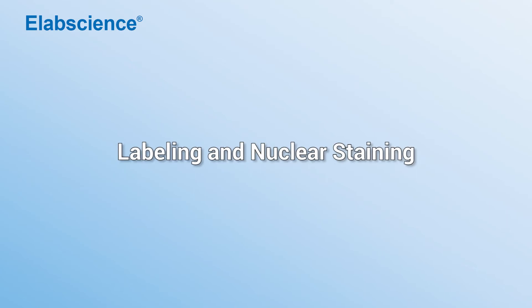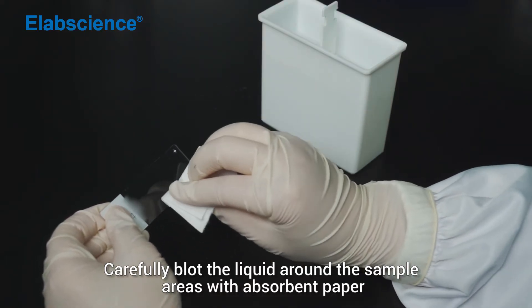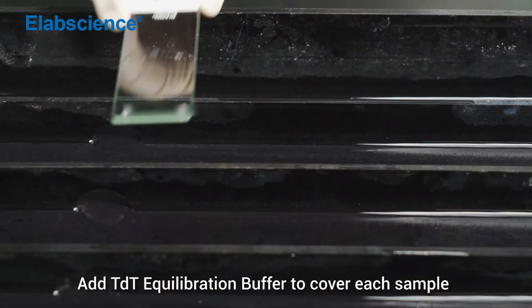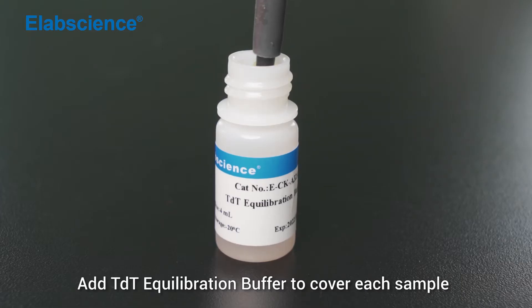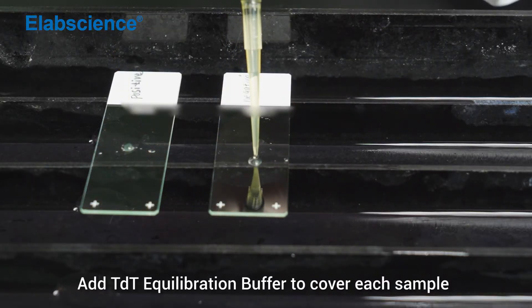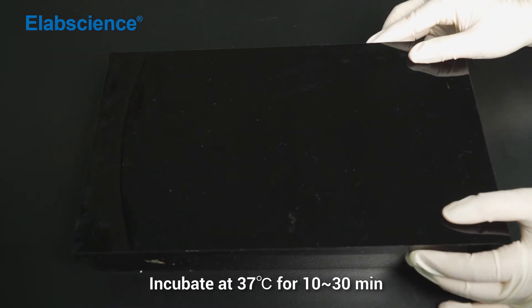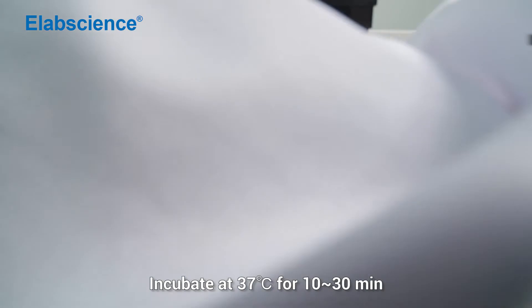Labeling and nuclear staining. Carefully blot the liquid around the sample areas with absorbent paper. Add TdT equilibration buffer to cover each sample. Incubate at 37 degrees for 10 to 30 minutes.